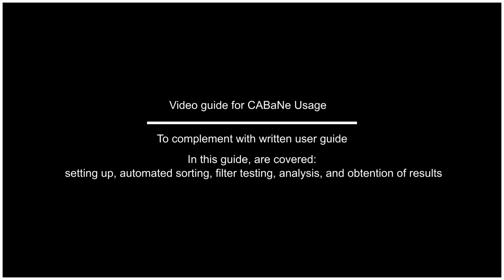Welcome to this video guide for CABaNe usage. It is a complement to the written user guide, and we will cover most of the basic steps.